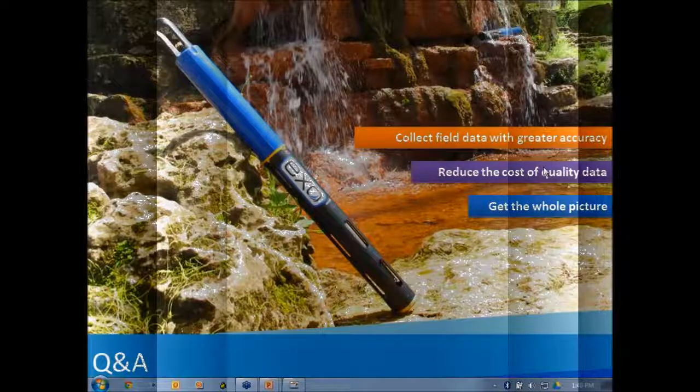We are always exciting and taking a chlorophyll A measurement, although in the data you saw, there wasn't much response of chlorophyll even during the cyanobacteria bloom. That's why the chlorophyll line was relatively flat, because the majority of the algae biomass was coming from cyanobacteria. I hope that clears up a couple questions.